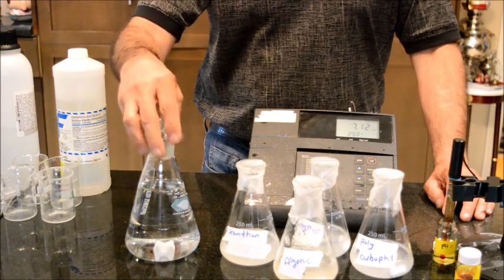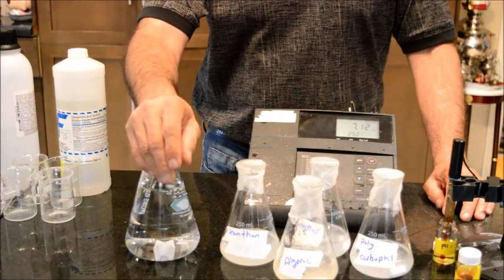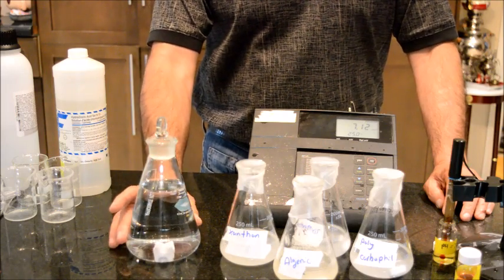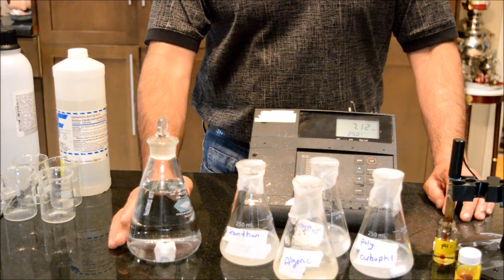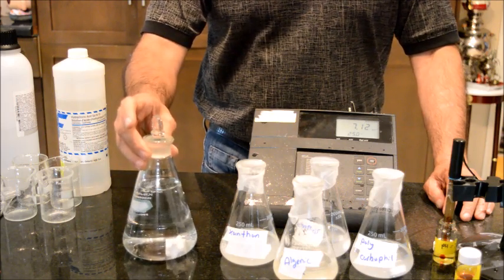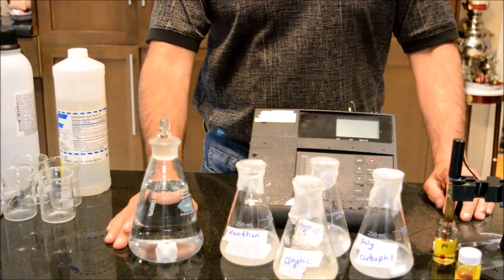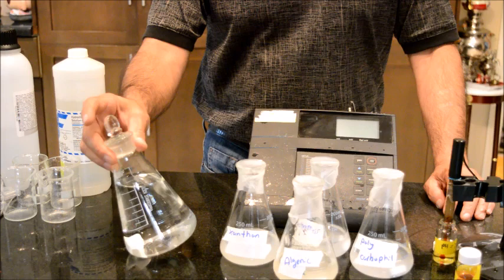Now, the simulated vaginal fluid, there is a recipe for it that you can search up. And as I recall, this solution contains salt, potassium hydroxide, calcium hydroxide, glycerin, urea, lactic acid, acetic acid, bovine serum, and I think this is it. I don't think I missed anything. So you could get all these excipients and just follow the recipe and make your simulated vaginal fluid.